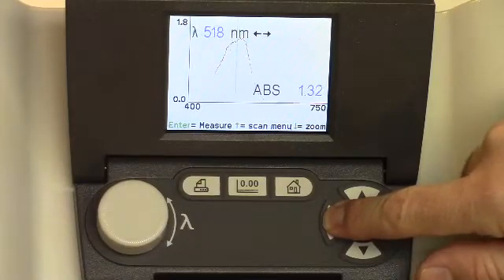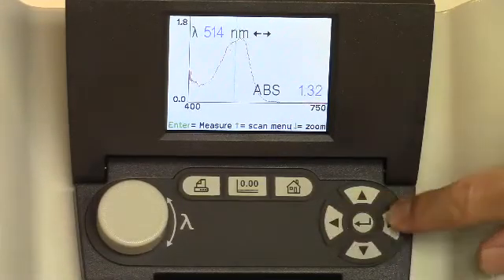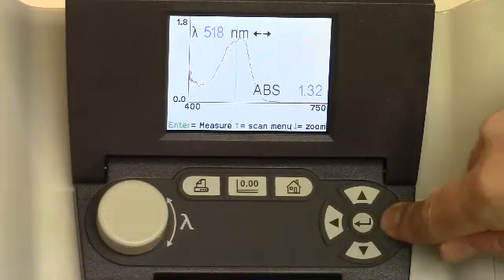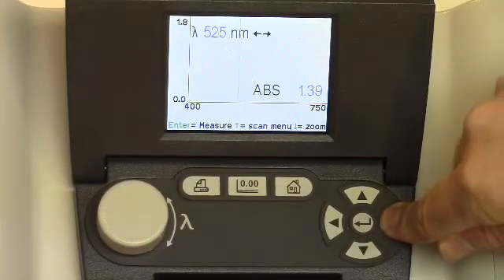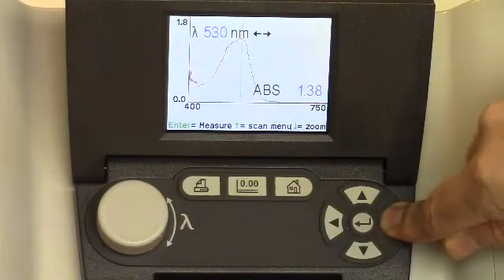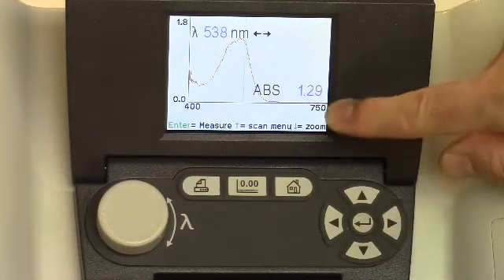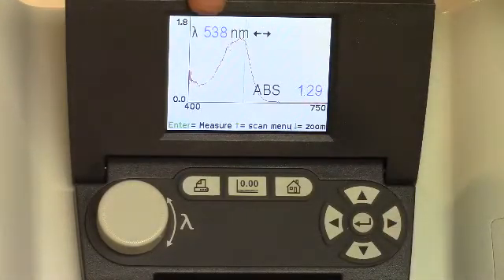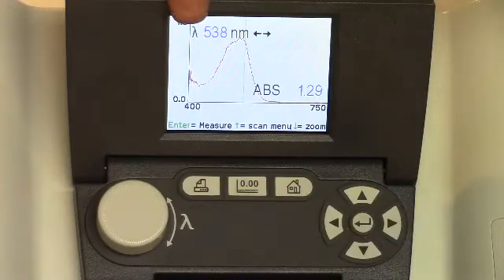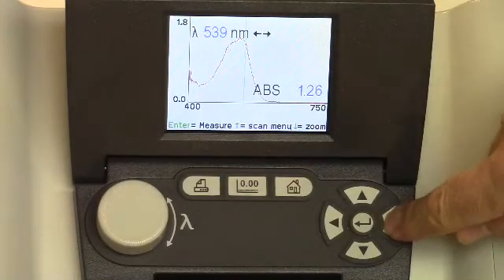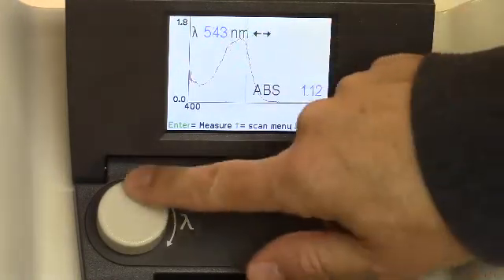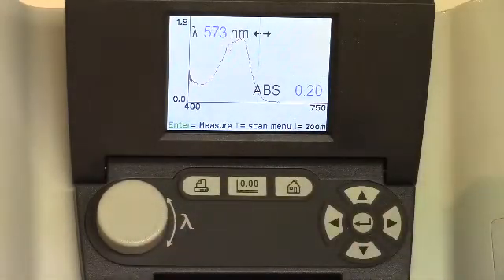And it looks like it's starting to go back down again over here. So let me scan back this way. And so you can enter in that wavelength that has the maximum absorbance. So the biggest number here, we want to know what that wavelength is. This is the Greek letter lambda over here, which is the symbol that we use for wavelength. And you can see it's dropping off there. So that was our red sample.